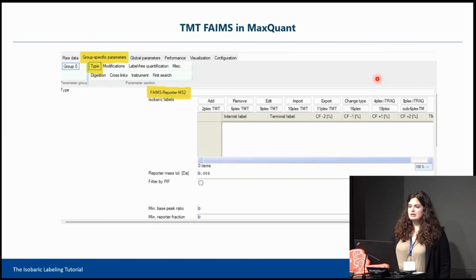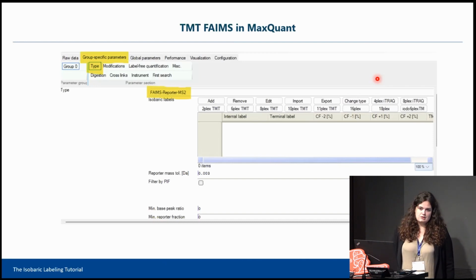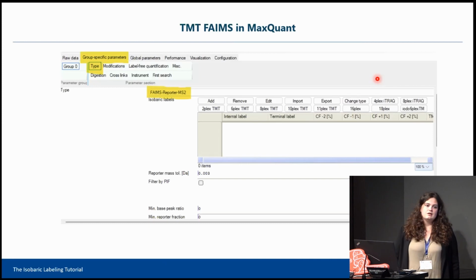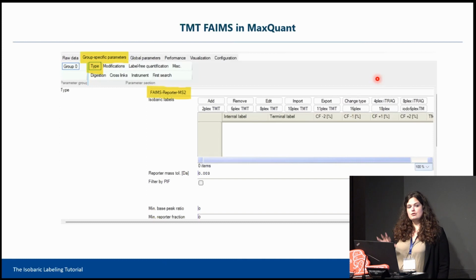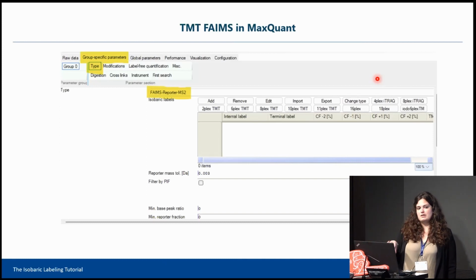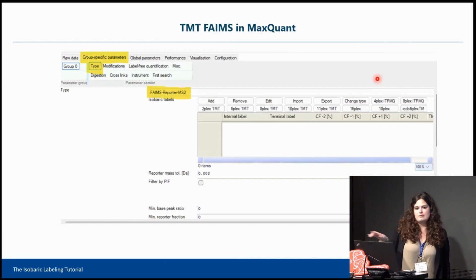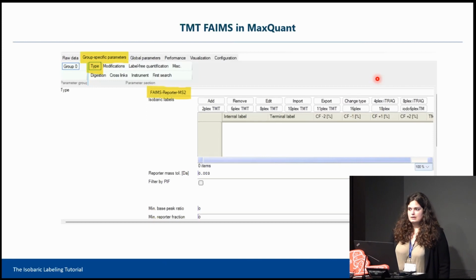As I said, later we will go to the PSMs normalization after the coffee break. And once again, I'm sorry that I showed you through screenshots, but we spent time preparing the tutorial so that you can go through each step after the summer school whenever you want and reproduce this. Plus you also have the PSMs session for that. Thank you.